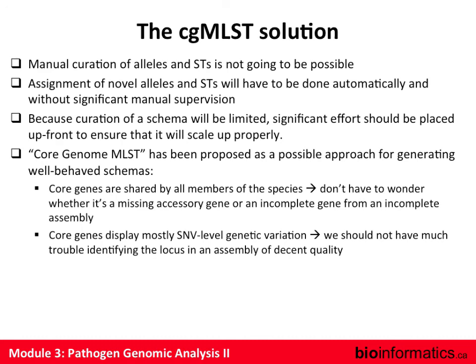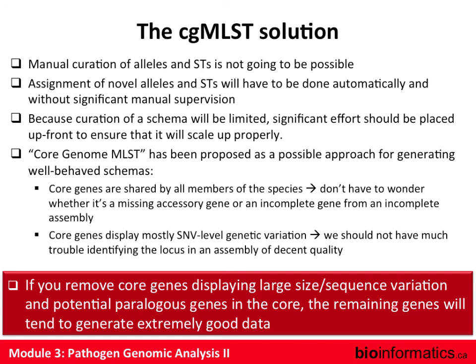So basically, if you stick to core genes, you remove the ones that vary quite a bit, and the remaining genes tend to behave really, really well. And they lend themselves to global surveillance, which is a big thing nowadays. Being able to share data across countries, being able to compare the profiles of things that are circulating here versus elsewhere.